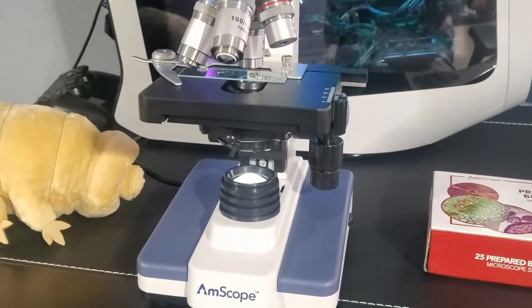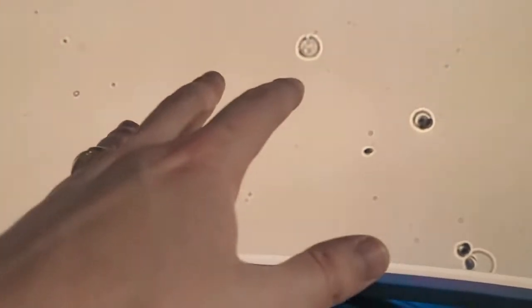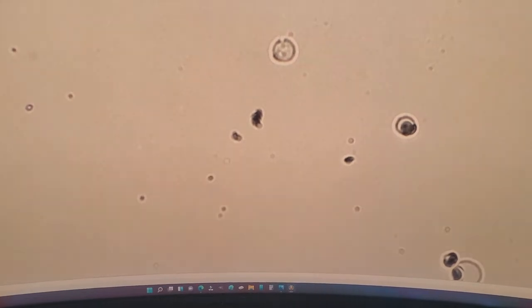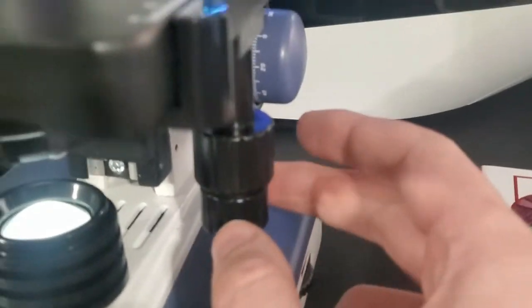Alright guys, I'm going to show you a few details of the AmScope. Right now I've got it zoomed in super close on the computer screen, and you can record with this program right on your computer — that's included with the AmScope. Down here this adjusts the light. If I do this it's going to adjust the light, and of course it affects the view on screen. There's tons of light; we can put a little less. You can manually adjust it, which is really nice. They also let you do all these options in here to adjust the image.